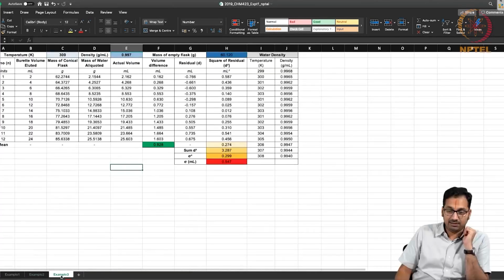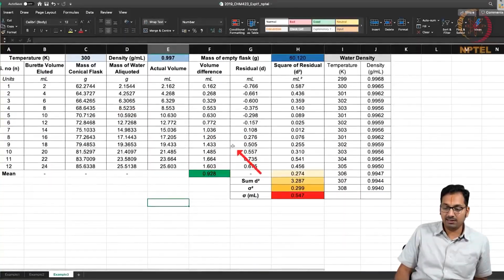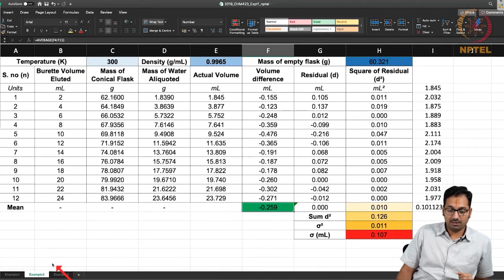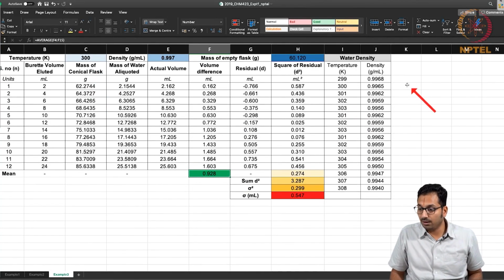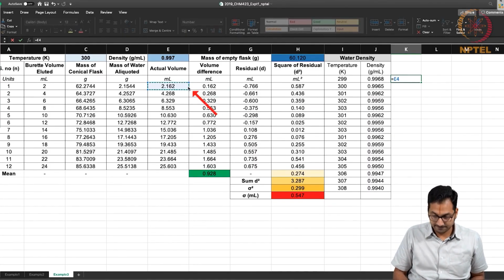Let's quickly take yet another example. In this case, what ends up happening, this has been done wantedly, where the average is quite far away. In this case you are able to see a certain number that comes, but it is much farther away. This probably once again indicates something. Let us quickly take a look at how far away this researcher is in each of the measurements.